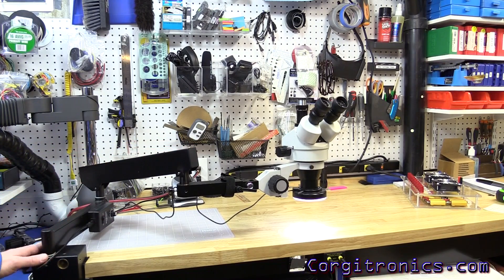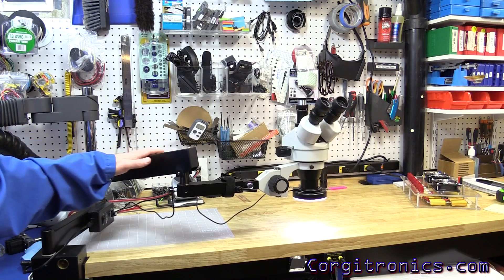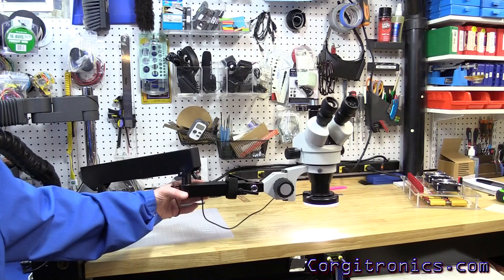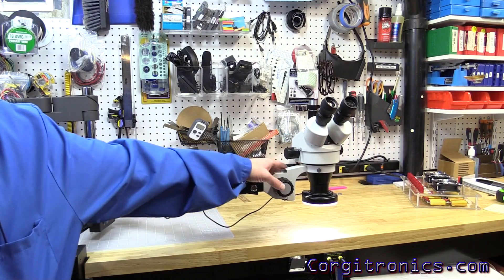There's a clamp down at the base, a pivot point, the first lower arm, the center riser, a vertically adjustable arm, another pivot point, and then a short arm out to the head.